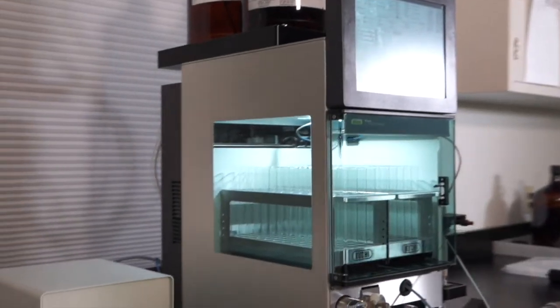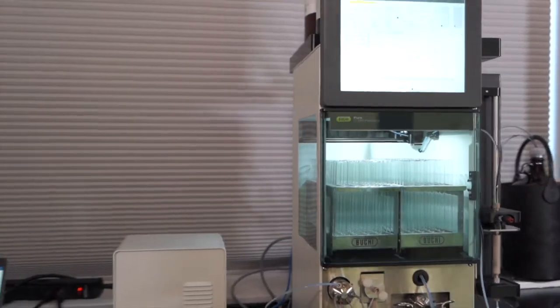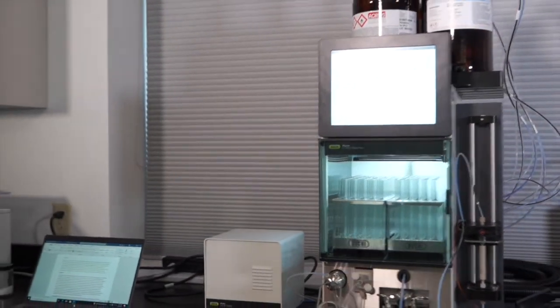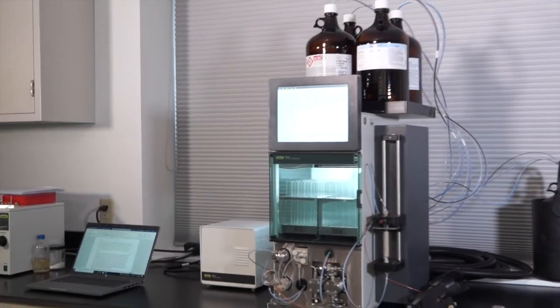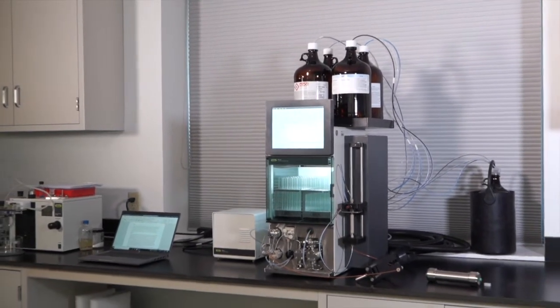Fortunately, setting gradient, checking fractions, and reviewing your chromatograph stays exactly the same as I've previously shown in flash mode. And that's it! Pure simplicity for separating your most complex samples.